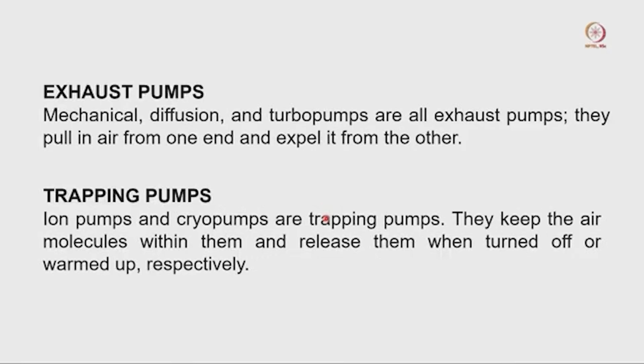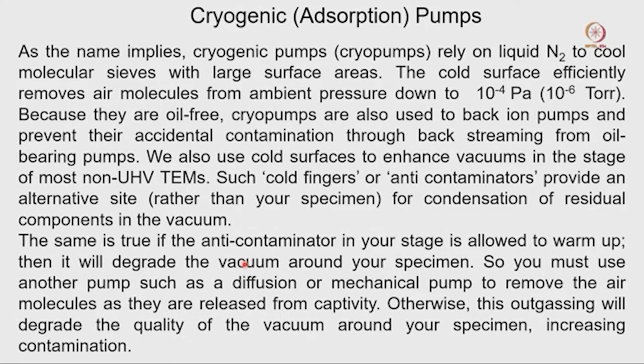Okay. So, now take a look at this. I already mentioned the exhaust pump and the trapping pump. Now, we will discuss one more pump, which is called the cryogenic pump. What is the cryogenic pump?